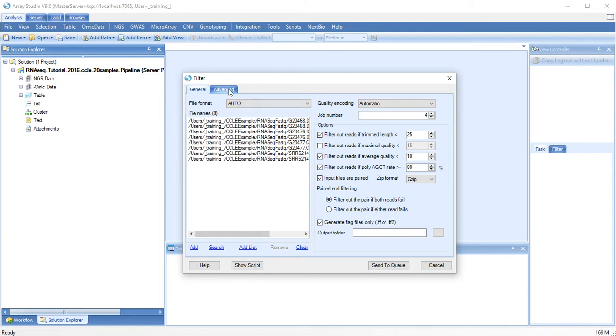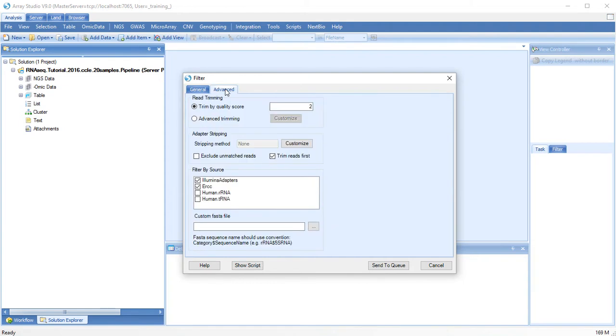The Advanced tab gives you more control over advanced trimming options. By default, low quality ends of reads on the 3' end will be trimmed.